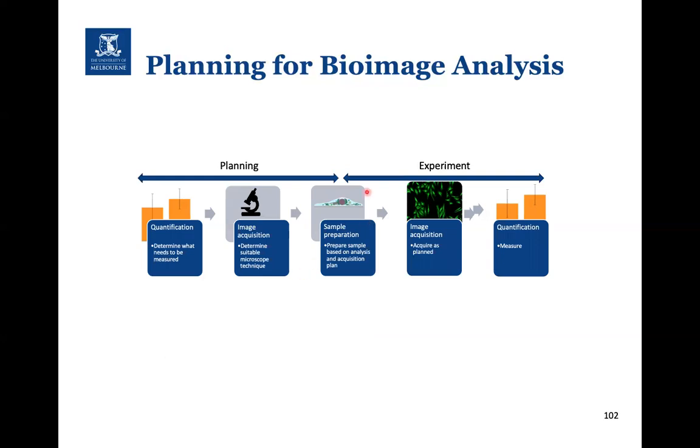Finally, when we come to do the experiments, ooh, my microscope's gone a bit weird. My computer's gone weird. When we actually come to do the experiments, everything's pre-planned. We know what we're doing when it comes to the acquisition, and probably we already know what we're doing in terms of the quantification as well.